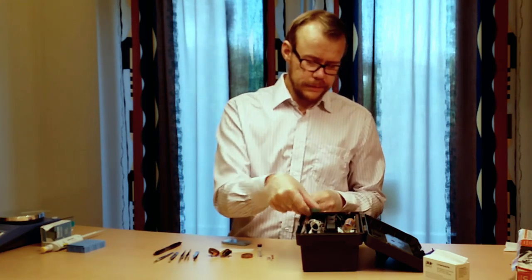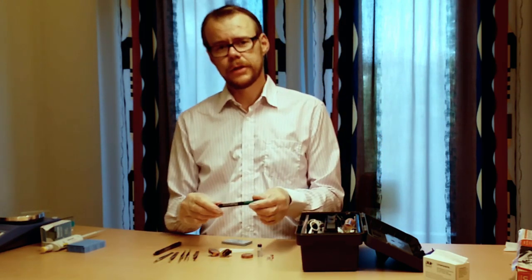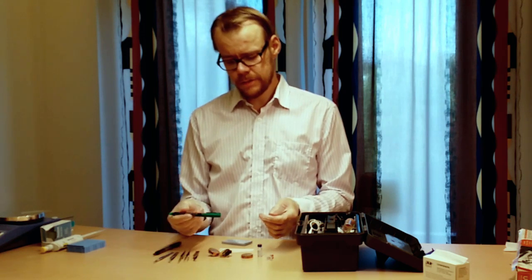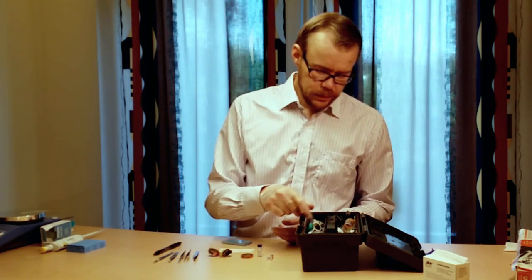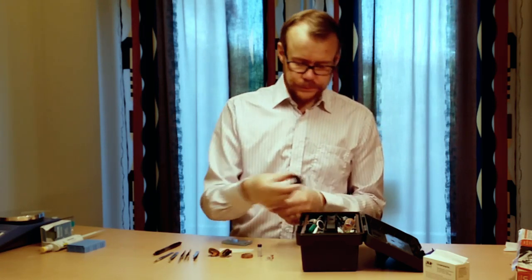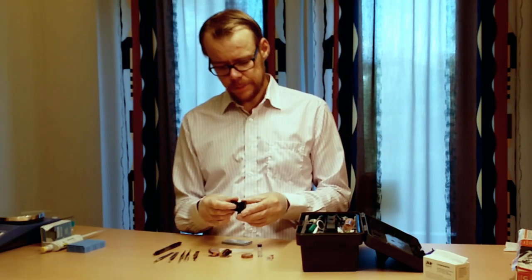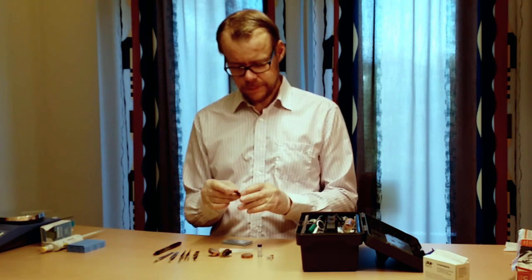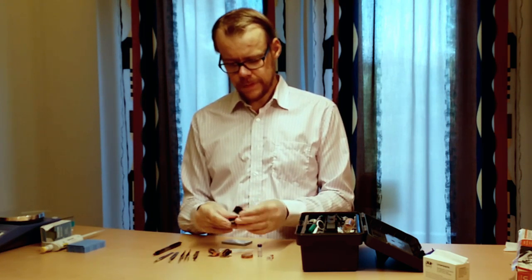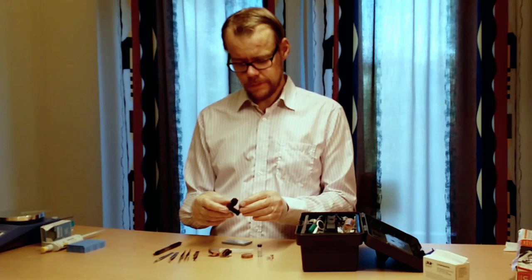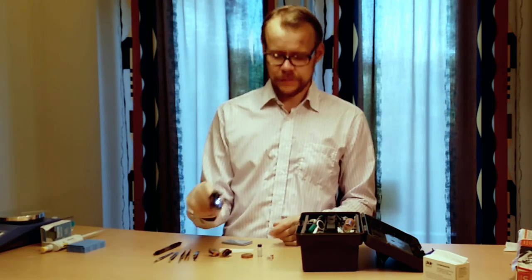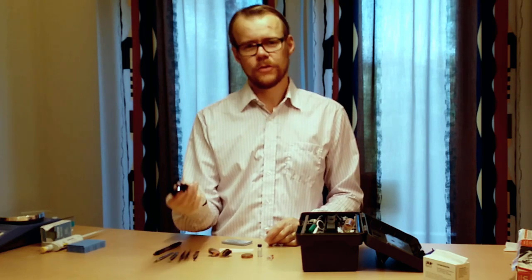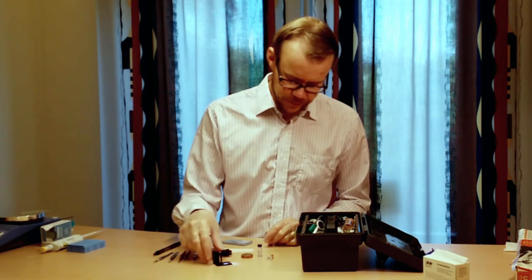You also need to have permanent marking pens to write on all the samples and things. What kind it is. That is very handy. A small cheap magnifier glass like this can be very useful. This is also included with light. It costs sort of nothing. It is very neat to use.